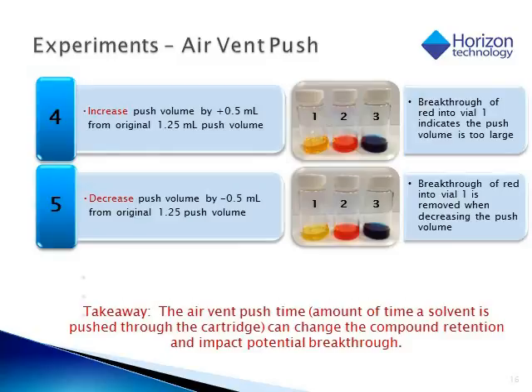So the takeaway from the air vent push is that it's the amount of time a solvent is pushed through the cartridge. If you push too long, you may actually have some breakthrough of the next compound from the sorbent into your elution tube.